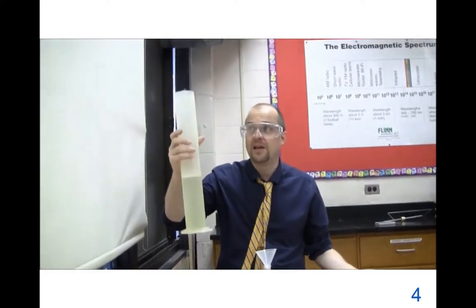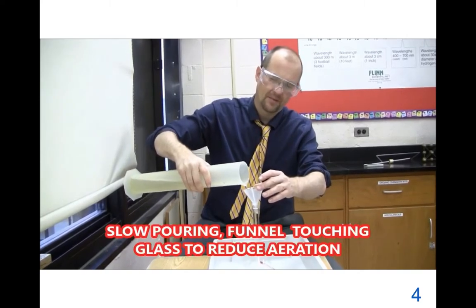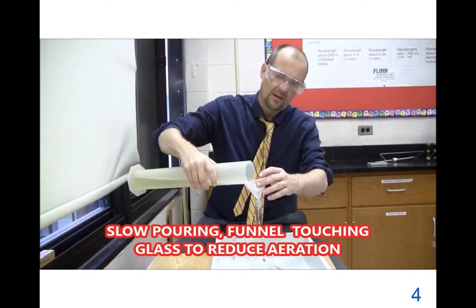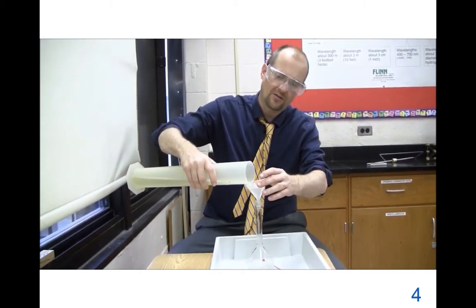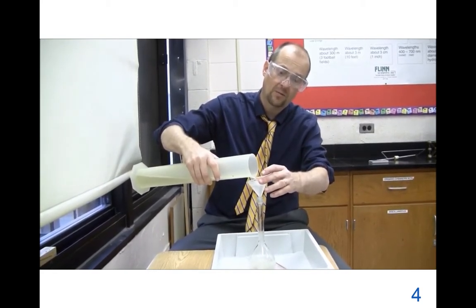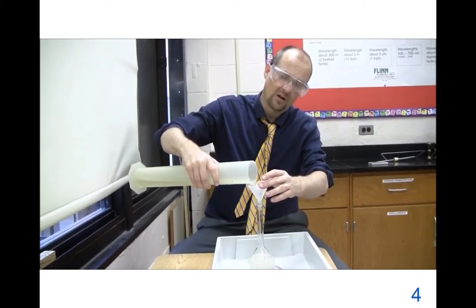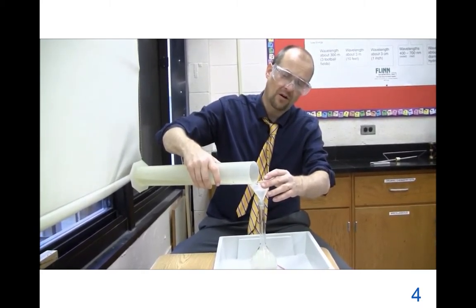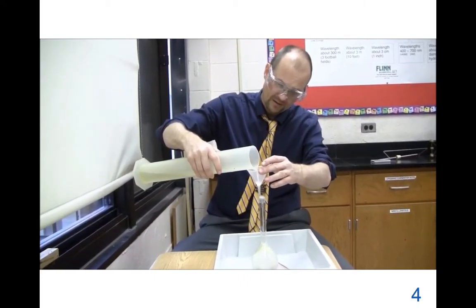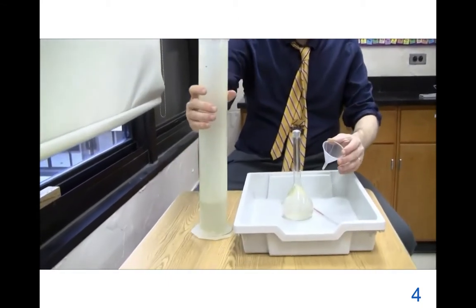This is water from the East River of New York. So I'm going to put it into this container. Now you need to have a known volume of water. This is a 250 milliliter volumetric flask, but I'm actually going to fill it up completely. It's going to be slightly more than 250, and I'm going to have to work that out later. I don't want to leave any air in the flask because then I'll be measuring the oxygen from the air and the water. I just want to measure it from the water. So I'm absolutely going to fill this up, even overfill it.